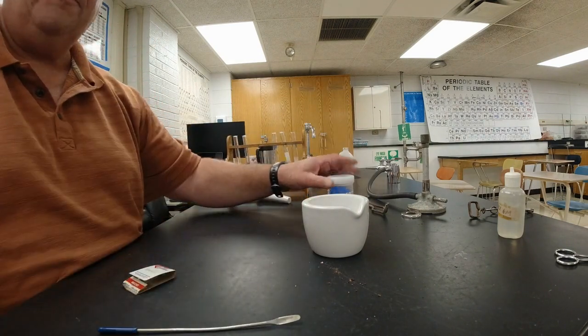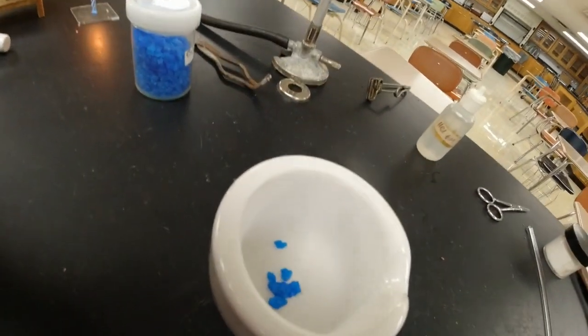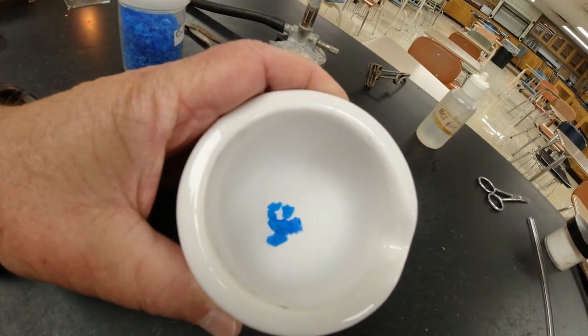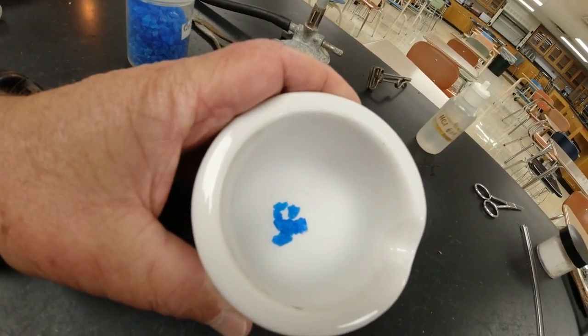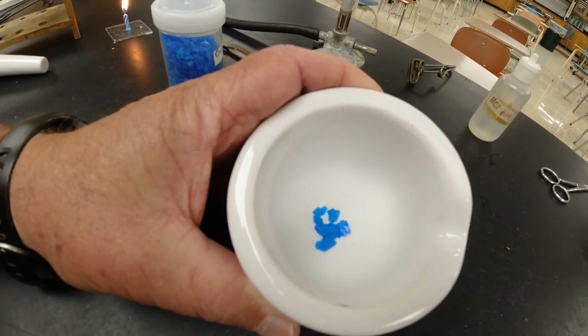Let me move the camera here. You guys can see the bright blue crystals in there and what color they are. They're a nice royal blue, pretty color like that. Don't eat them, all right? And so now you guys have seen that.